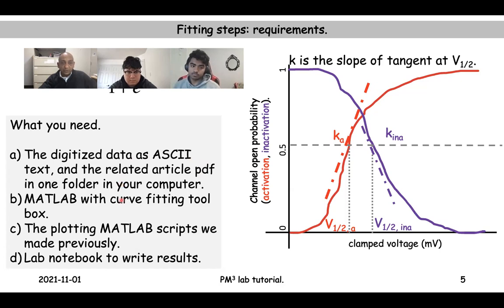You are also looking for MATLAB with the curve fitting toolbox in it. And that should be open in your computer simultaneously to this digitized data. The plotting scripts that you may have made, something that I may have shared with you.